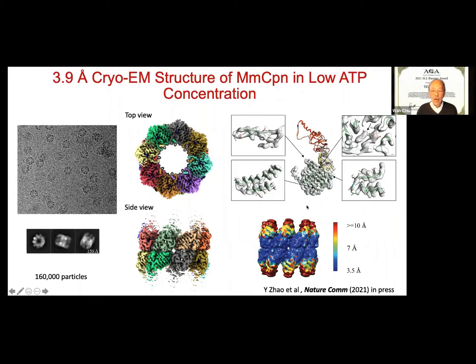So the question that I raised at this point is, okay, they wash out when we average 160,000 particles in this case, but what does it look like in each of these subunits? The next few slides demonstrate how we can get at the conformations of each of these subunits in each MM-cpn particle.